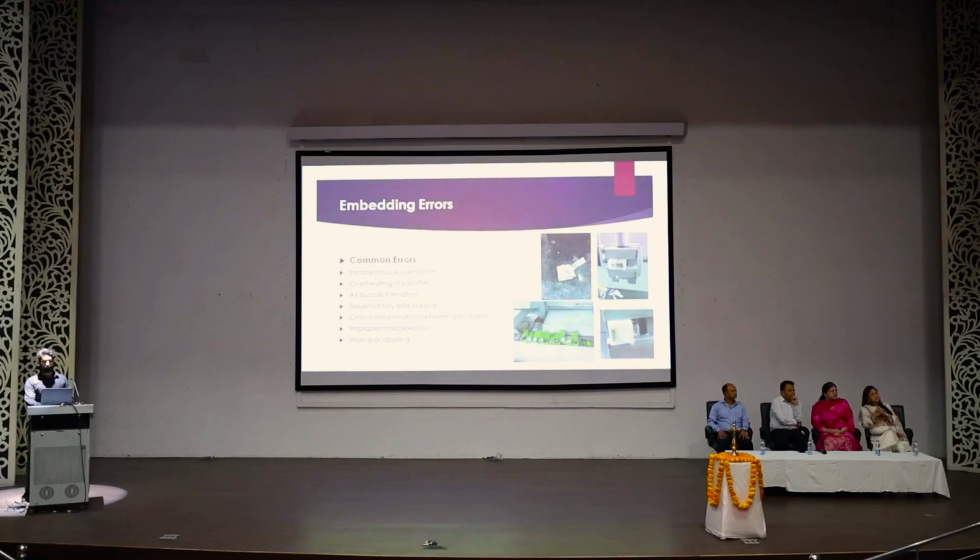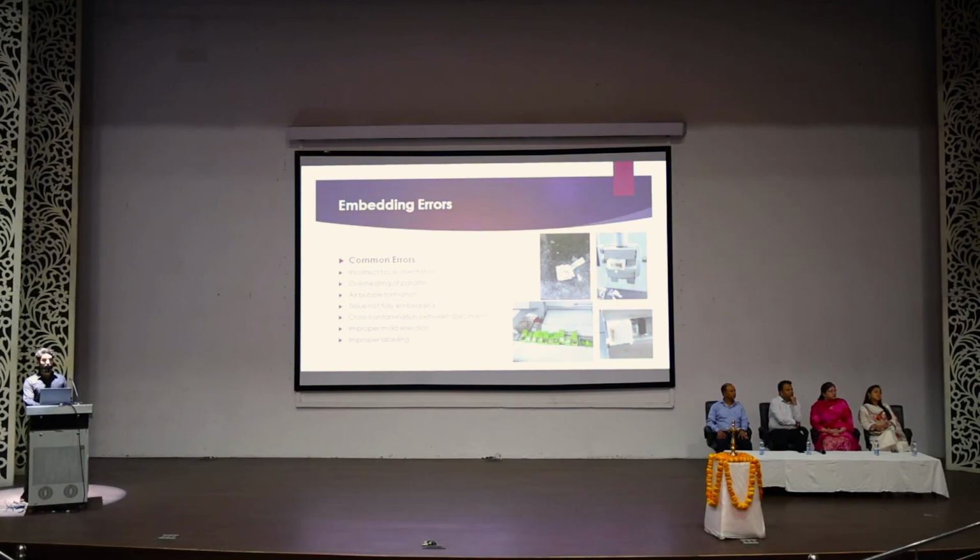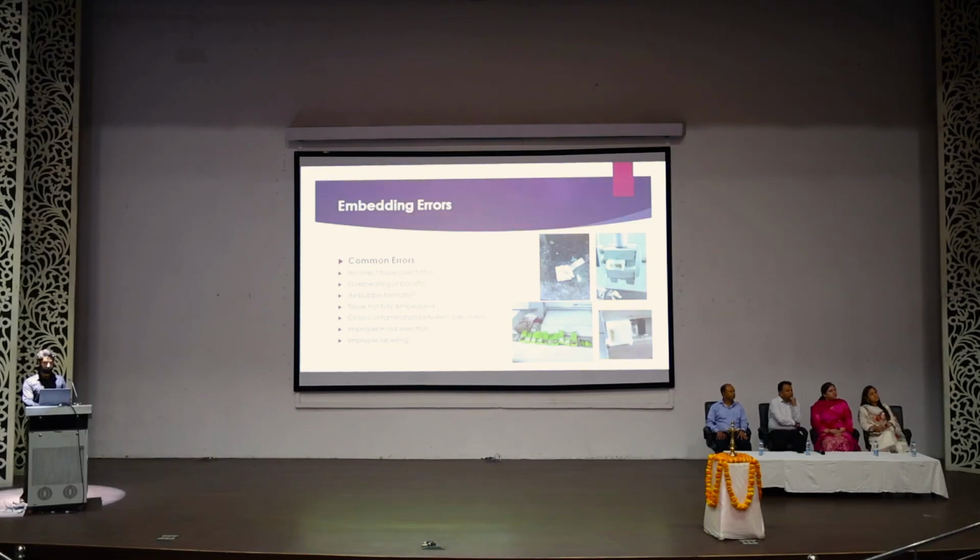And you can see here, there is a crack. There is a crack present here. As I told you, the possibility of cracking is when the block is cooled rapidly after formation of the block. So when multiple plastic tissue cassettes are opened during embedding, there is always a possibility of cross-contamination of specimens.